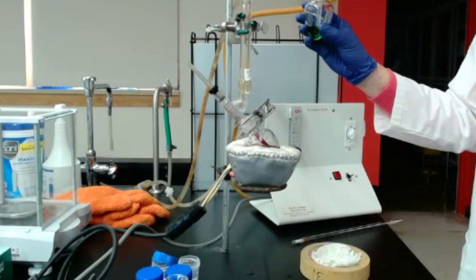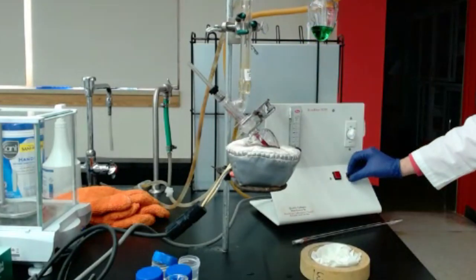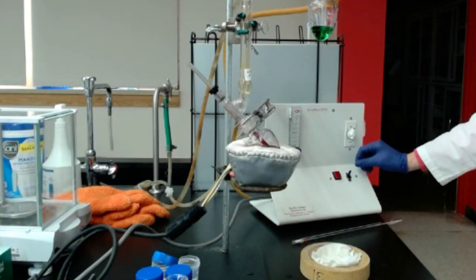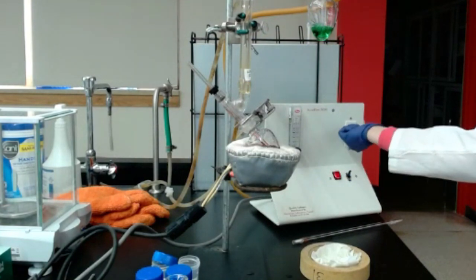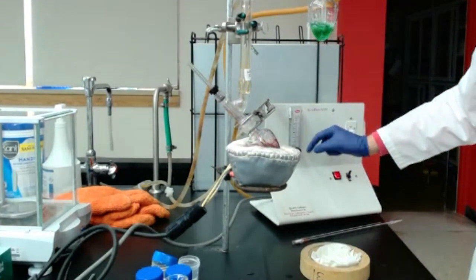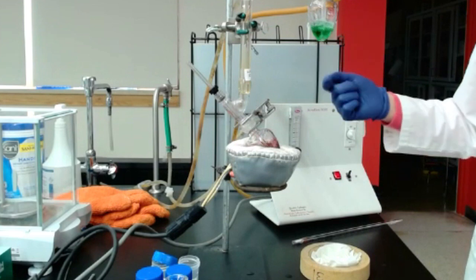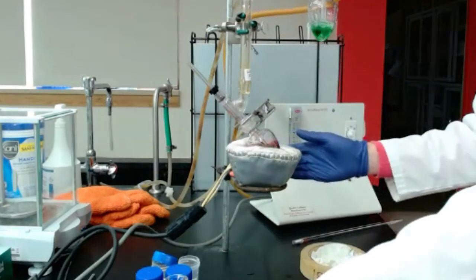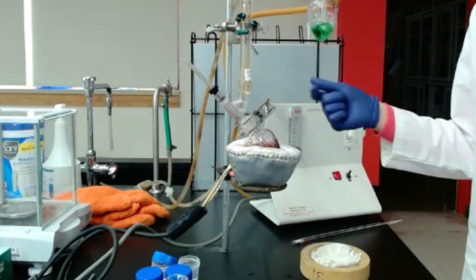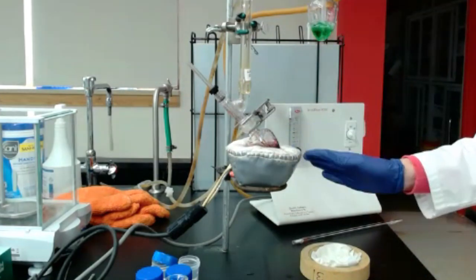All right, once everything is set up, you can once again turn on your airflow. Put 15 minutes. And make sure the flow rate is 1 liter per minute. It's going to run for 15 minutes. And that's where we're going to measure bound SO2.